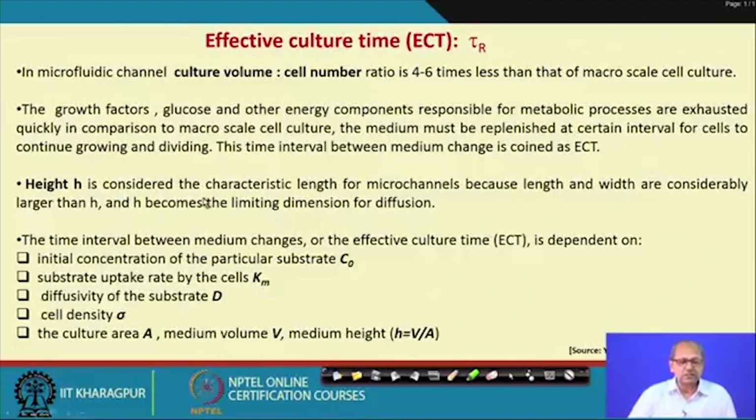Here height is considered to be the characteristic length, because in the microchannel the length and width are considerably larger than the height, and height becomes the limiting dimension of the diffusion.